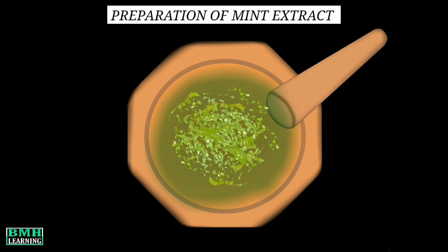Next we are going to expose the bacteria to the mint plant extract. So for that purpose, we are using disc diffusion method. So let's prepare the agar solution for this. Let the solution get cool at room temperature. The solution is having a specific type of bacteria called E. coli. We can also take any other bacterial strain in this medium which is sensitive to the used plant, that is mint. But for simplicity, we are only going with one bacteria.